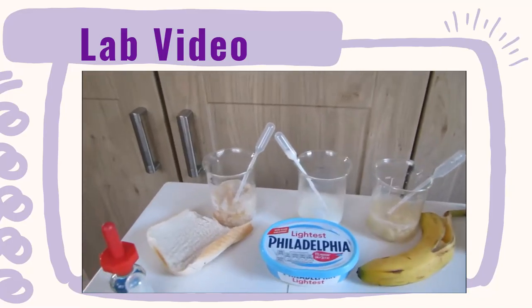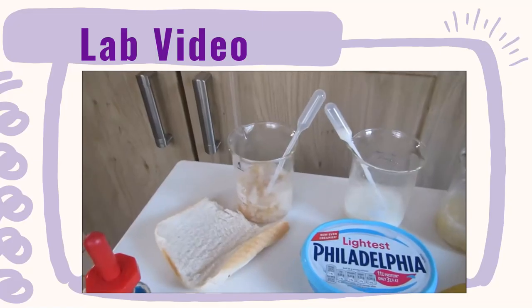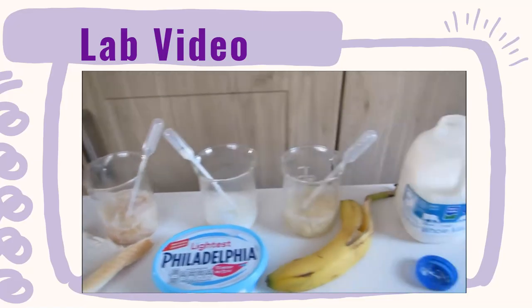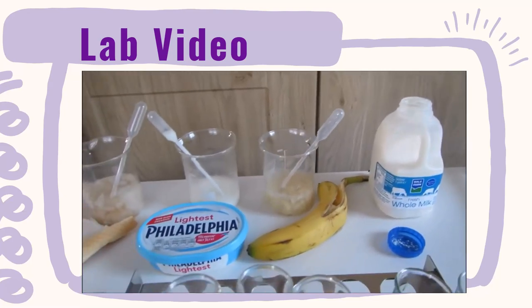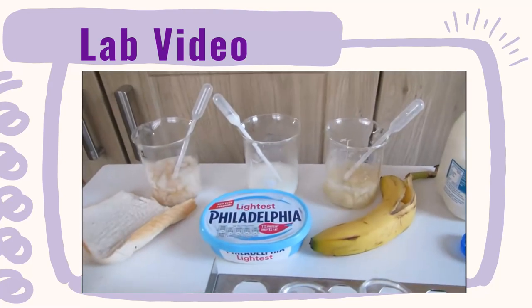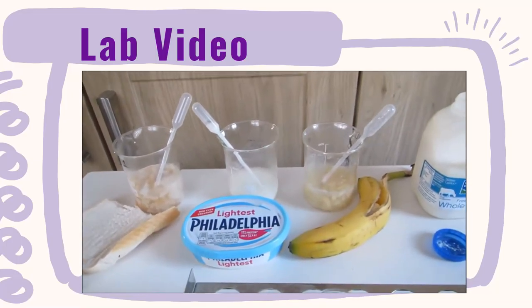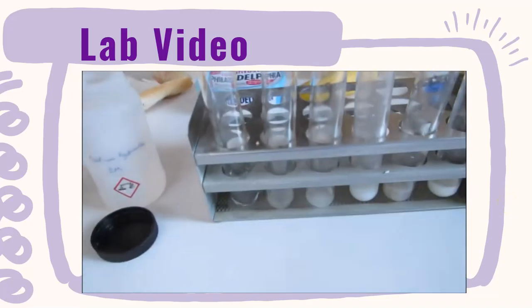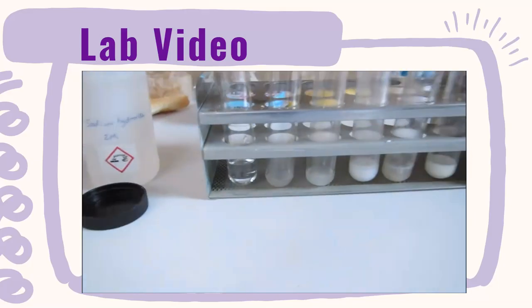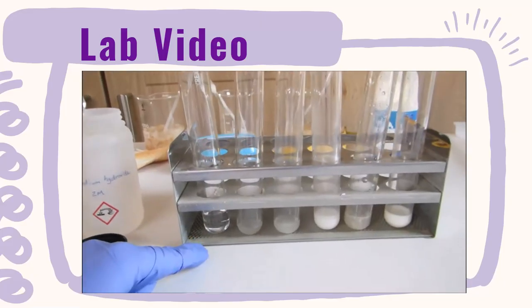I'm going to show you how to test for protein, lipids, starch, and finally sugars. So firstly, I have 4 foods I've made into a suspension with boiling water. So the first is bread, the second is the cheese spread, the third is banana, and the fourth is milk. So I'm going to test these 4 foods to see what food groups are contained in each. But so that you can decide yourself which food groups are contained, I'm going to show you the reaction of a positive and negative control, and then the reaction of each test of the 4 groups.